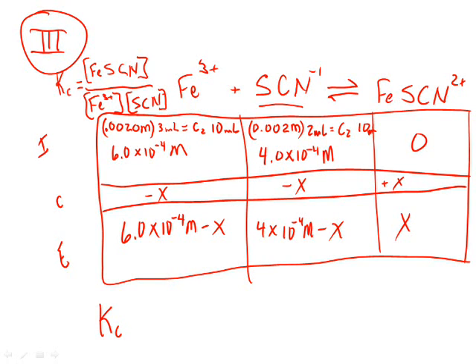And in the data yesterday, this worked pretty well. People who were careful were getting numbers that were probably within 3% of each other. I think all of their numbers that I saw yesterday were within 3% of the same value for the equilibrium constant. And so they just average those together and come up with the equilibrium constant.